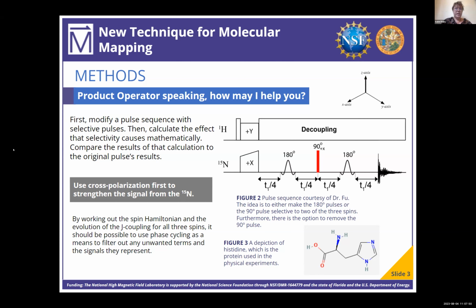There's two that are in a ring together. Those are close by. They're going to have J coupling with each other. And then there's a third nitrogen, which is farther away. But there's some interesting things happening where if you were to spin that ring around so that the nitrogen with the hydrogen on it was closer to that far left nitrogen, you could see how there could be some hydrogen bonding in between those two.